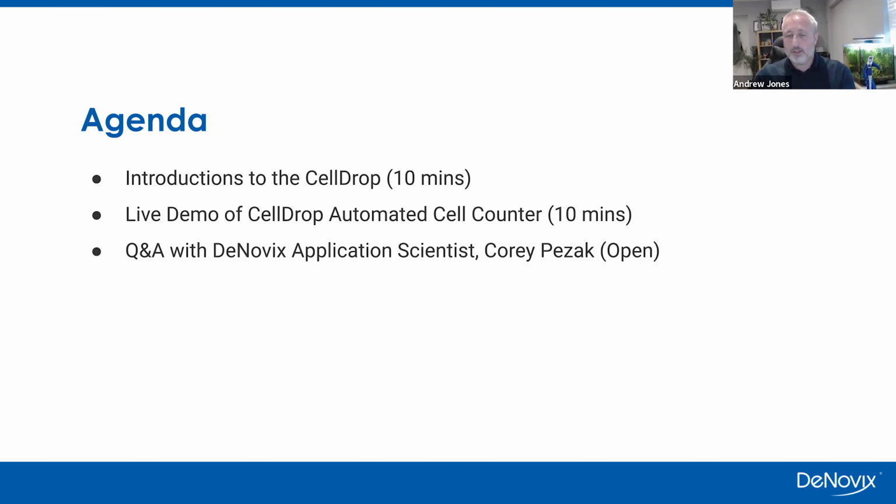The webinar will look something like this. We will have an introduction to the technology of CellDrop, which will take about 10 minutes, just for those of you who aren't familiar with it already. We'll then switch to a live demo. So Corey is based in our Wilmington, Delaware headquarters, and he's in the lab at the moment. He'll have some live cells that he's going to run to show you some examples of how to do that on the CellDrop. That'll take about 10 minutes. And then we'll also finish with a Q&A session.